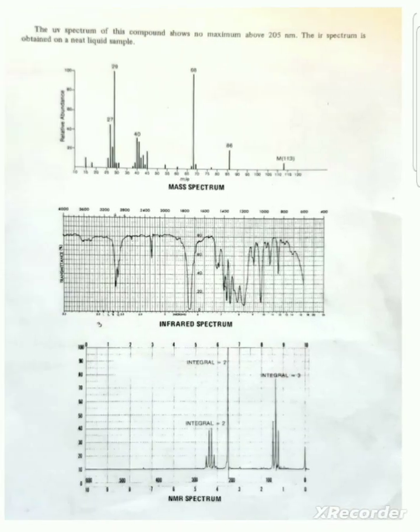Look at this infrared spectrum. You know that infrared spectrum is the one that we use only for functional groups. We need just to confirm and identify the functional group. Looking at this, when you check nicely, you'll find that in between 2800 and 3200 you'll find this peak here. You should know that near 3000 per centimeter is the frequency at which this functional group absorbs or vibrates, and that is CH stretch.